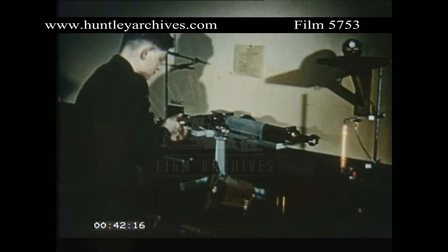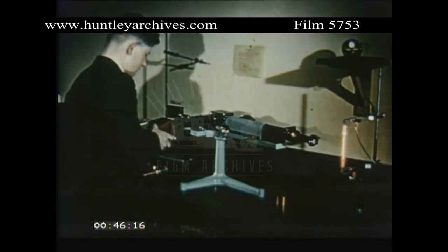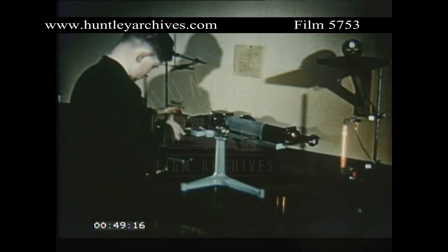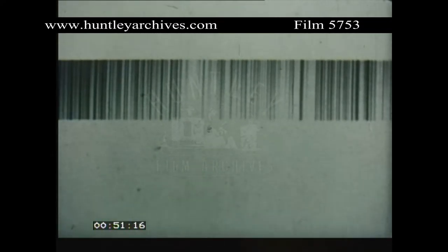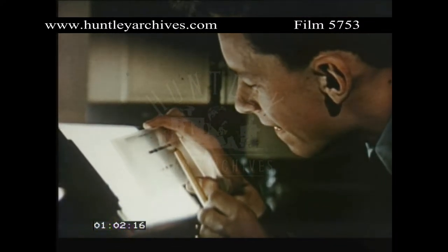If the eyepiece is replaced by a camera, the instrument becomes a spectrograph. And the photograph which it produces, a spectrogram — a permanent black and white record, generally used in negative form. The spectrum can now be measured, compared and preserved for use in later work.